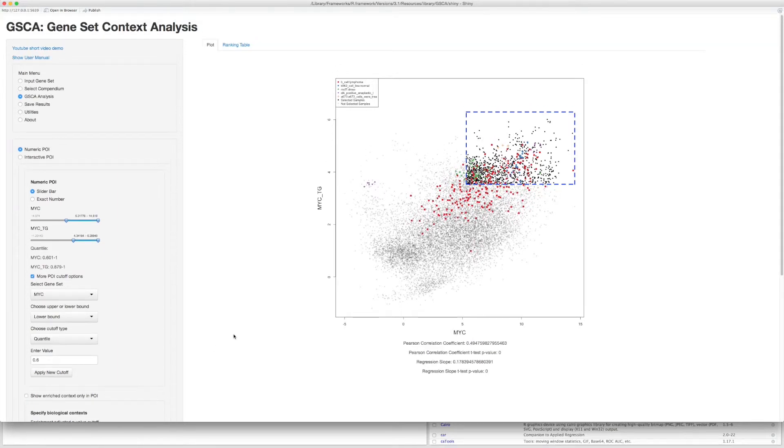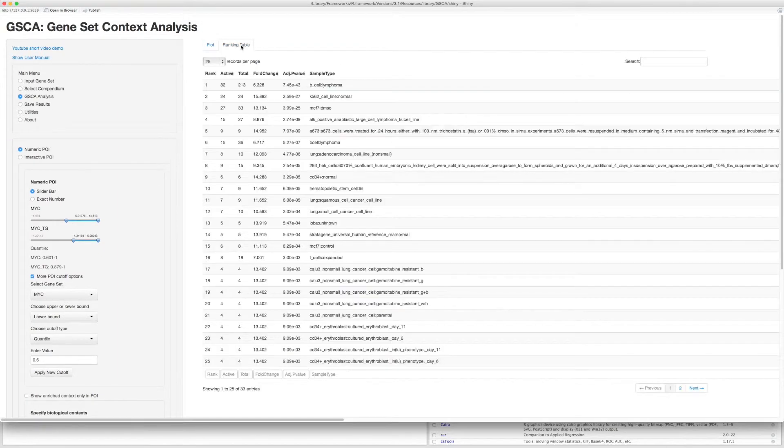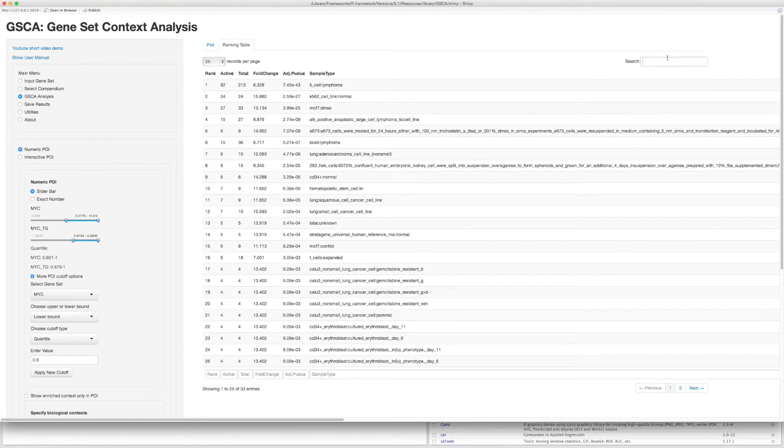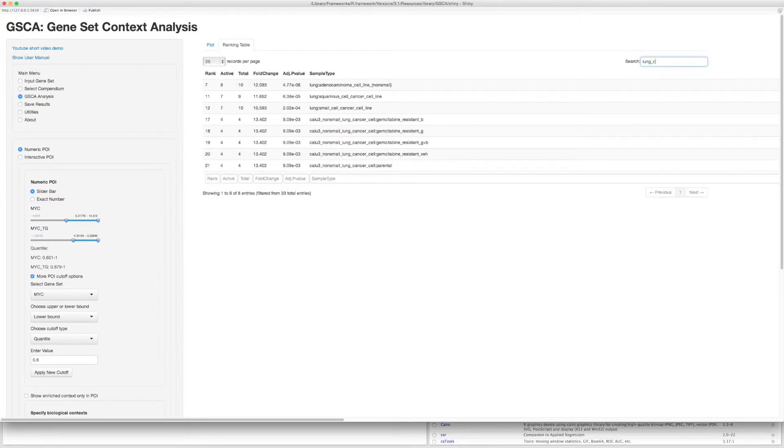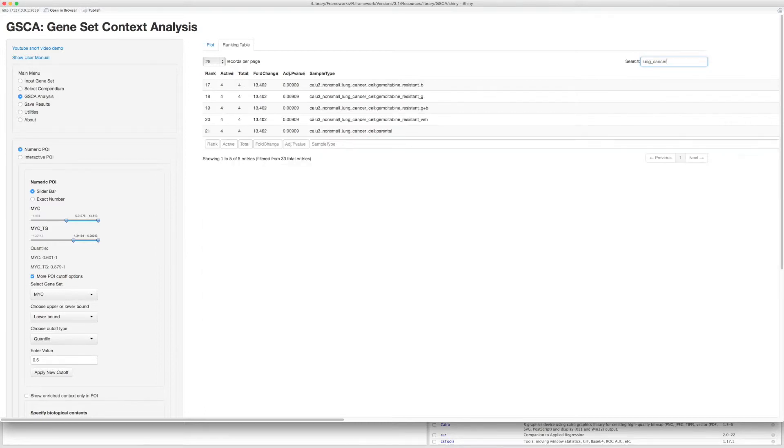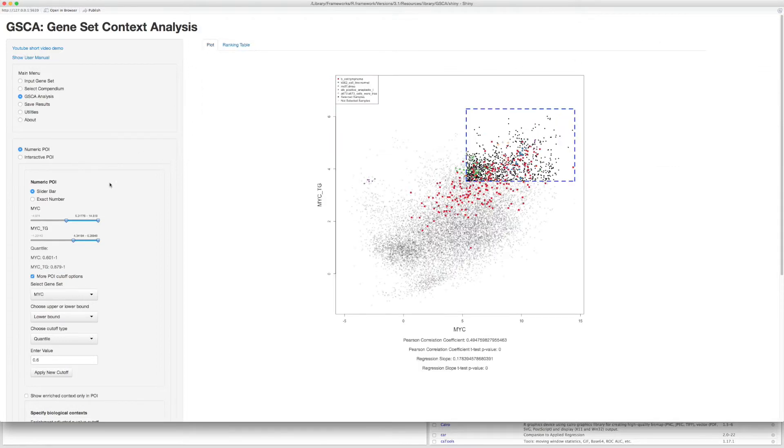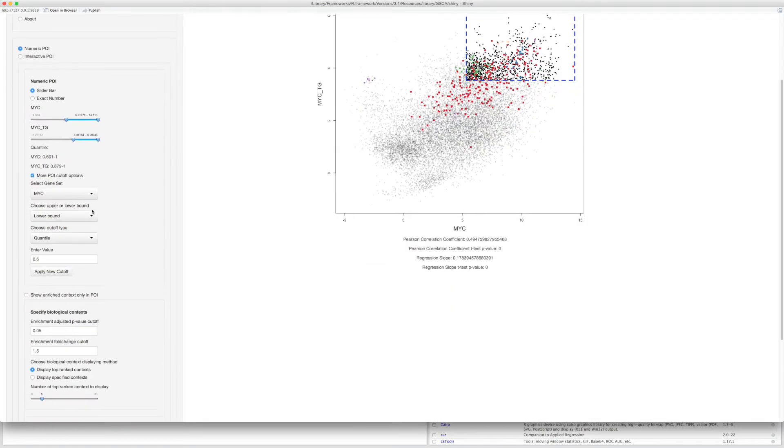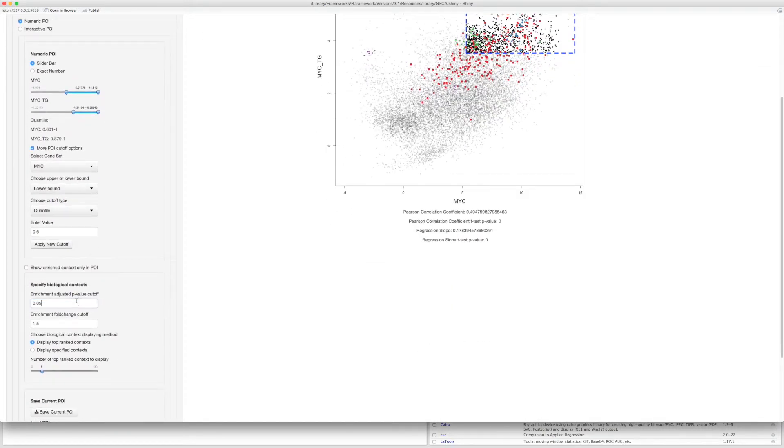For more details of the enriched biological contexts, you can go to the ranking table tab. For example, if you are interested in lung cancer, you can search a keyword here. And all the related biological contexts will be returned. You can also change the enrichment criteria by changing the adjusted p-value or fold change cutoffs.